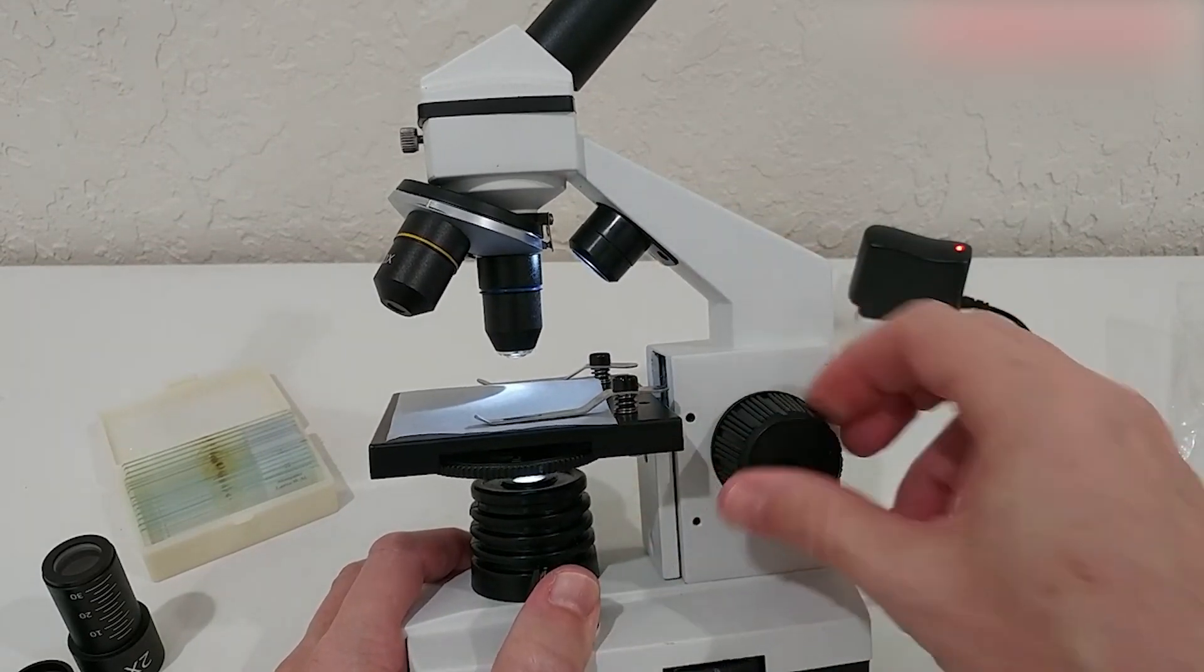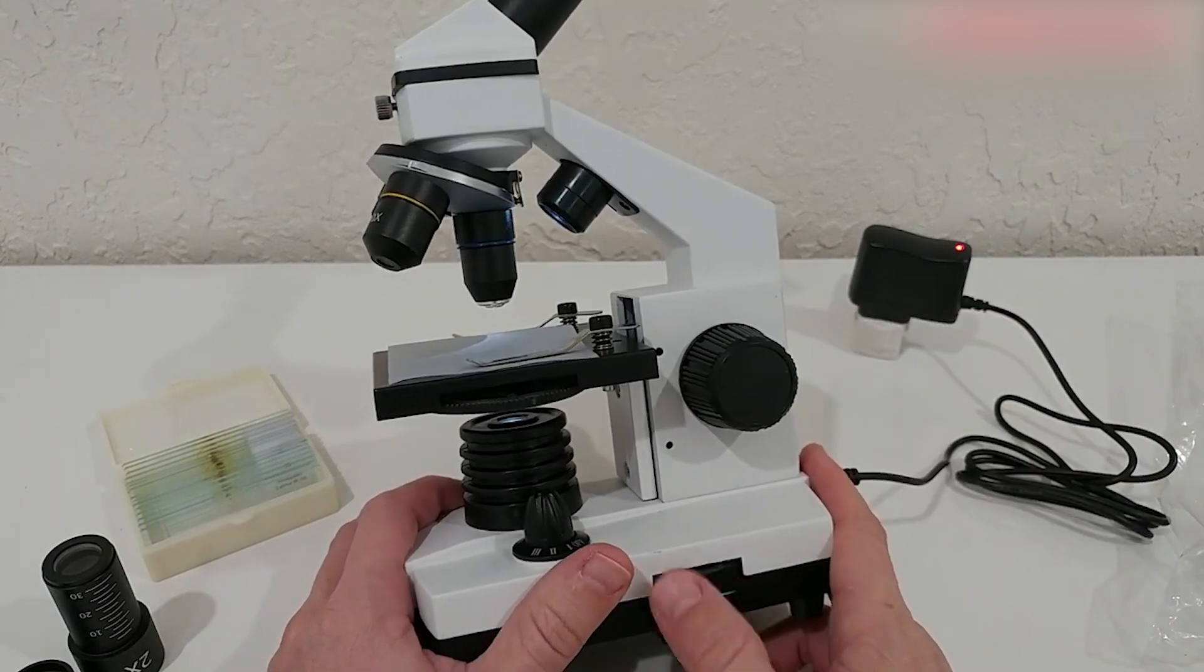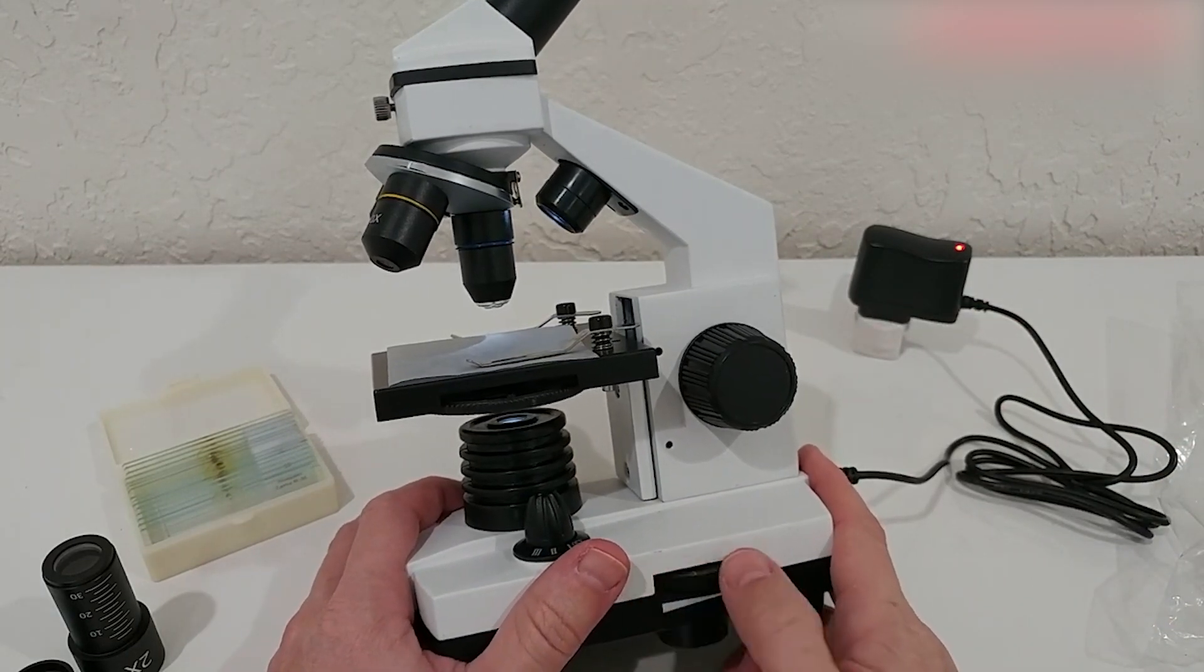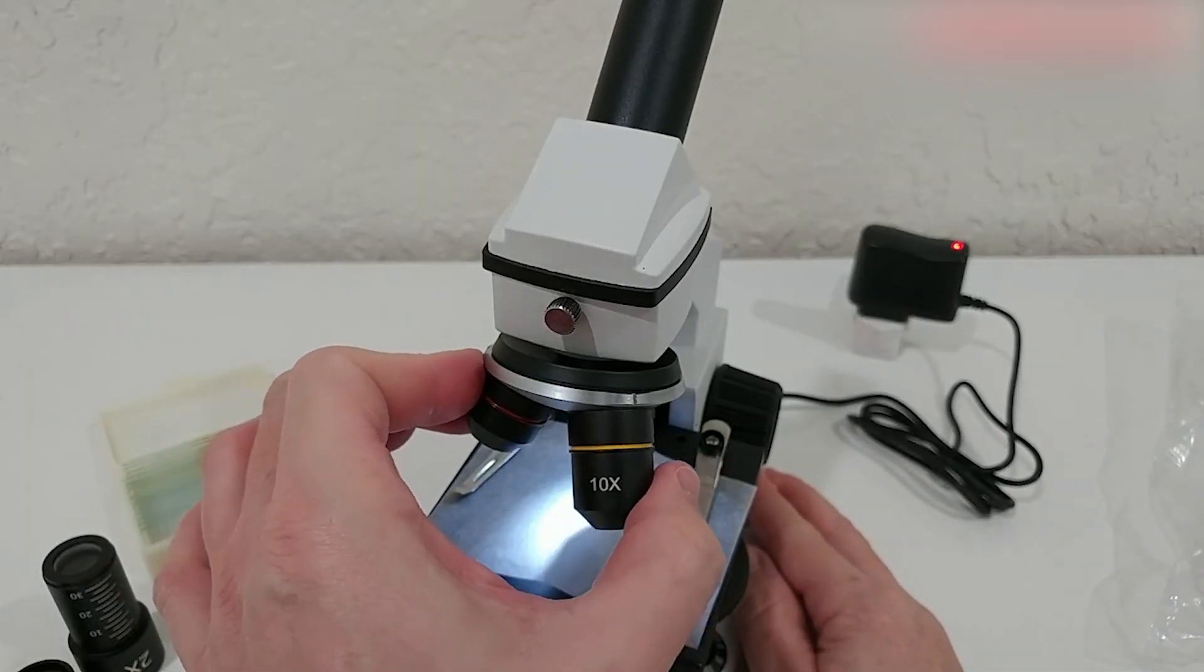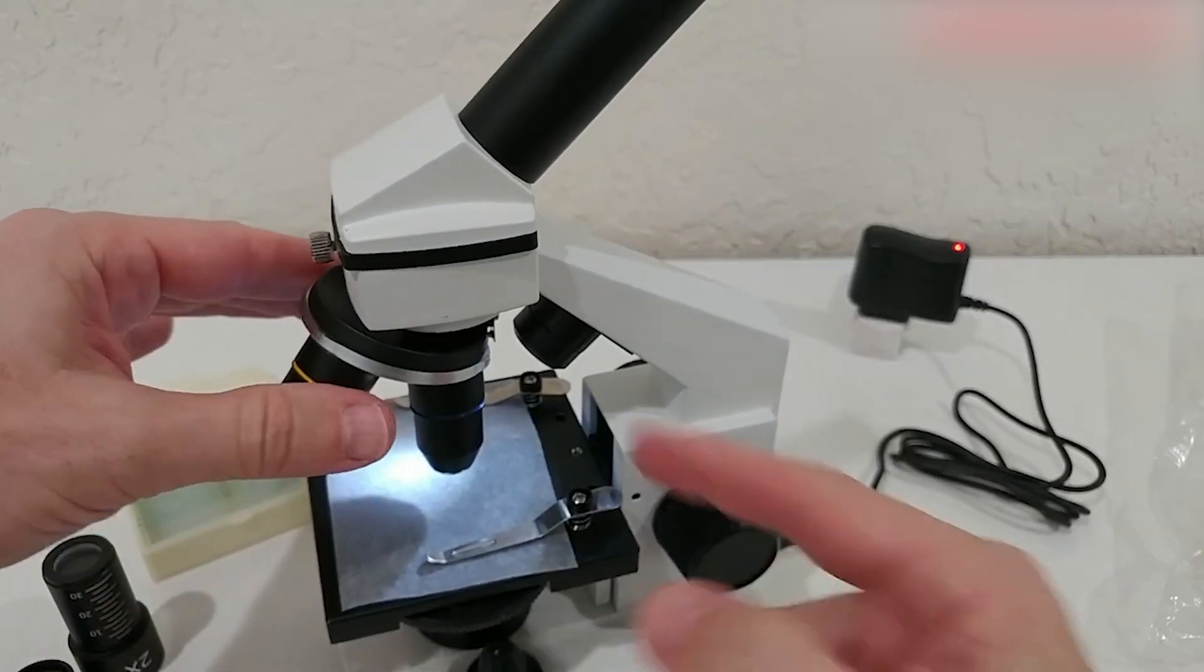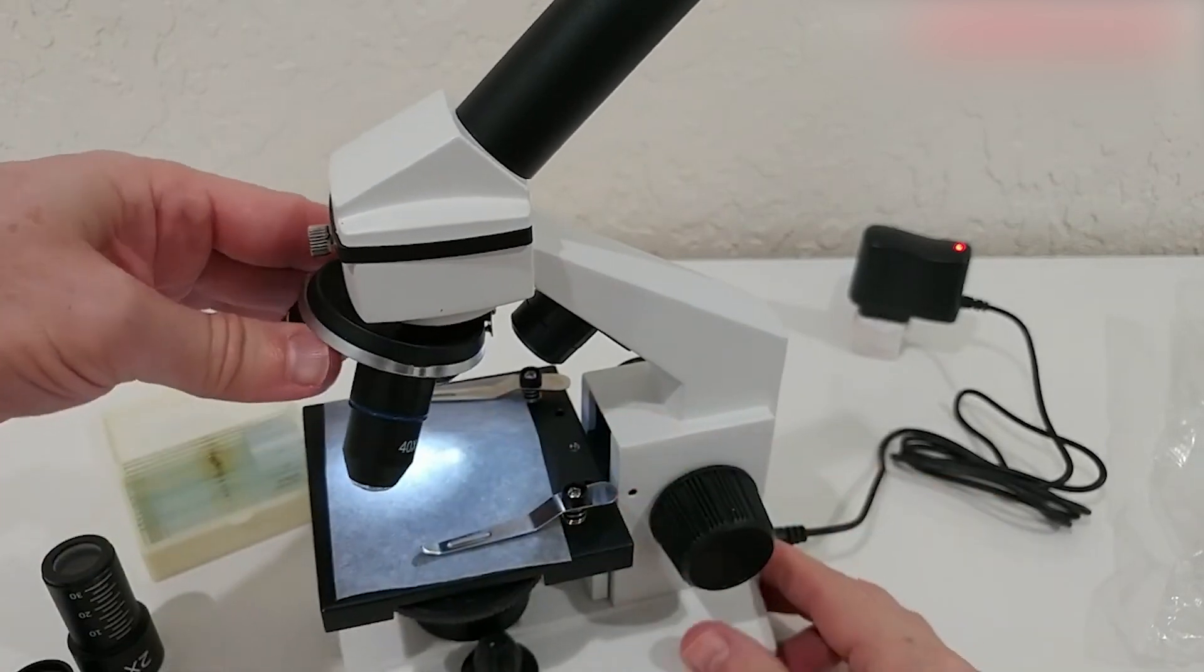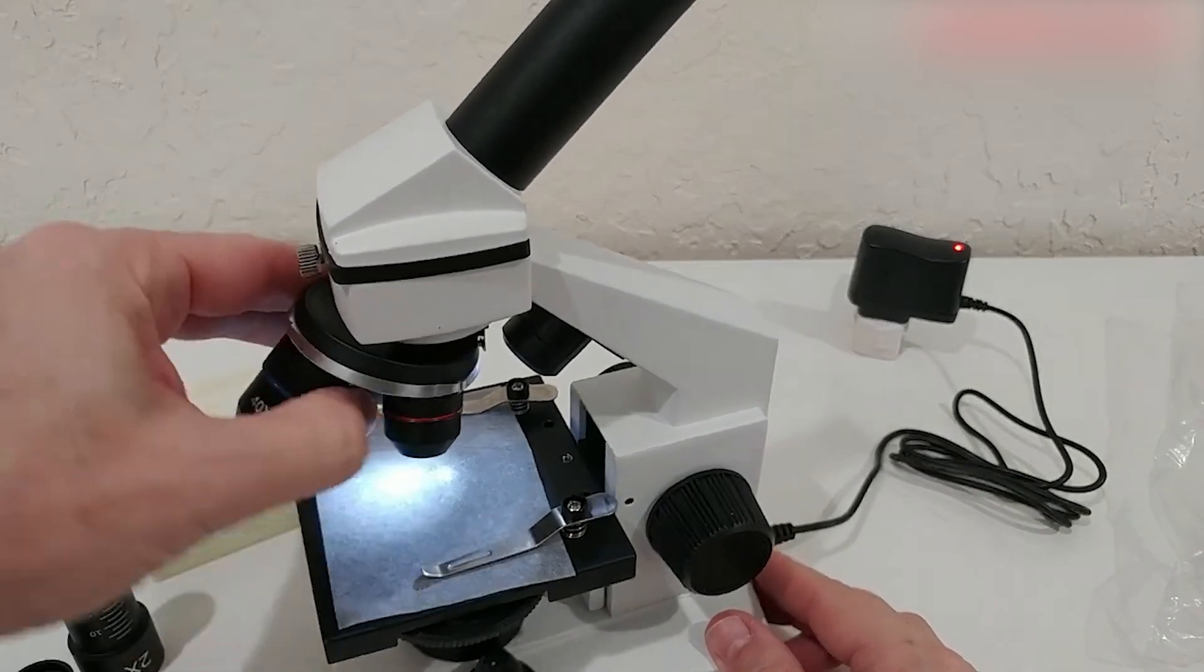To enhance your experience, this microscope set comes fully equipped with a variety of essential accessories. You'll find a wire shutter, 10 operating tools, a 15-piece microscope slide set, and a convenient carrying bag, all included.